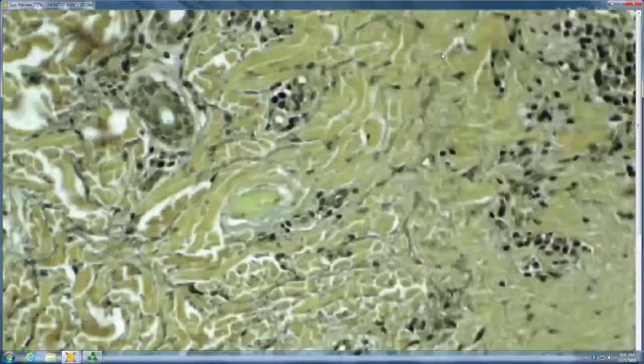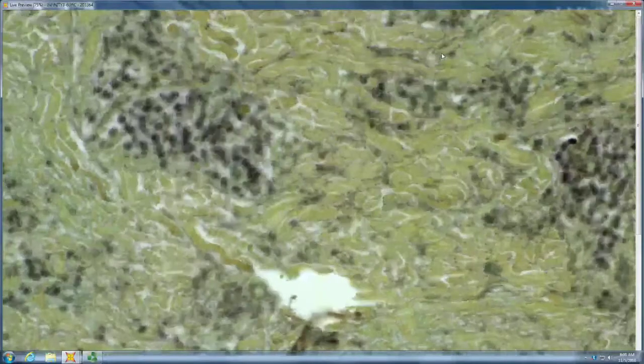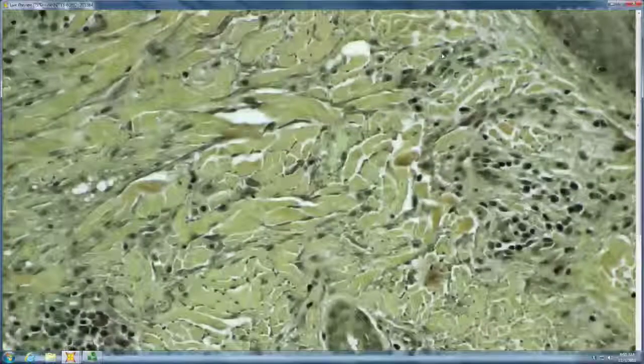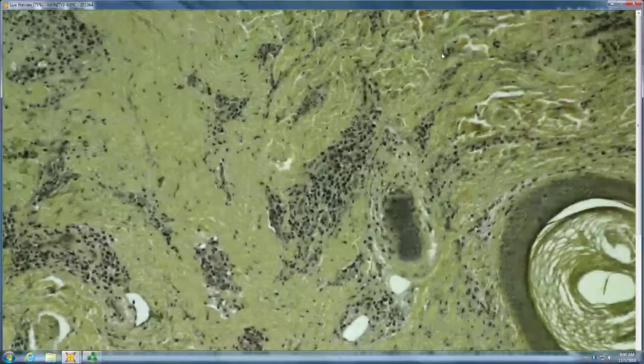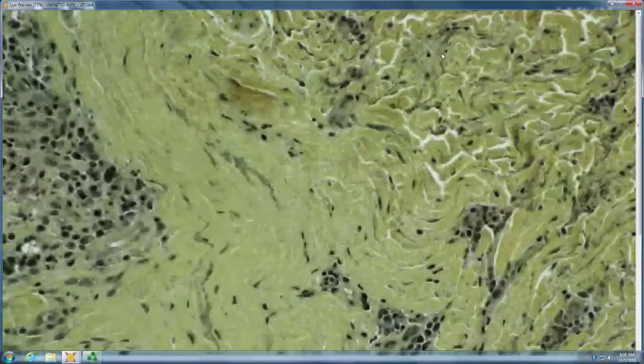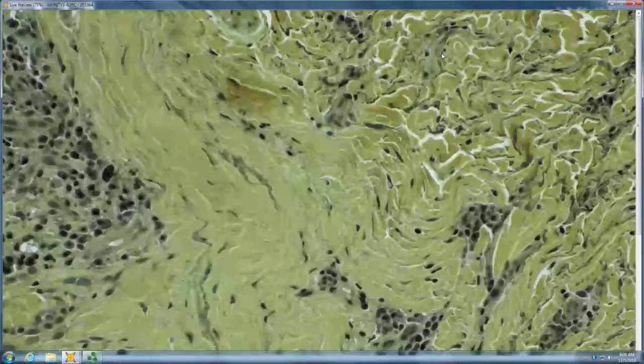What kind of stain is this? Elastic stain, right? So you see all your black elastic fibers there. In this case, they're a little more gray than black. You're going along the surface, and then you hit areas where you kind of lose your black. So see your elastic sheath. See how it kind of ends here.